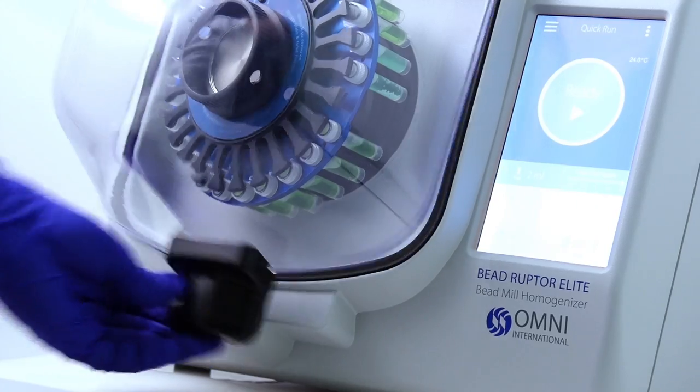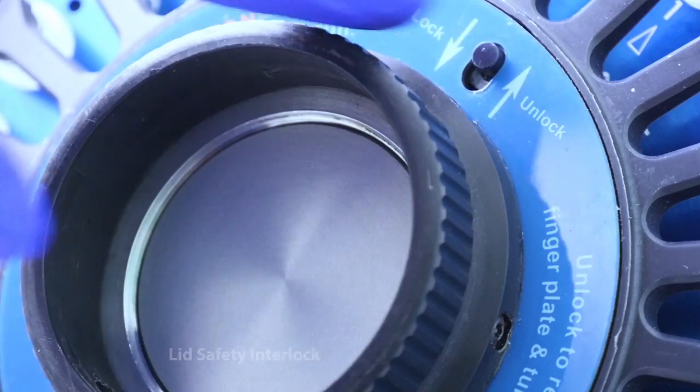Designed with safety in mind, the Bead Ruptor Elite is equipped with a sealed processing chamber and lid safety interlock.